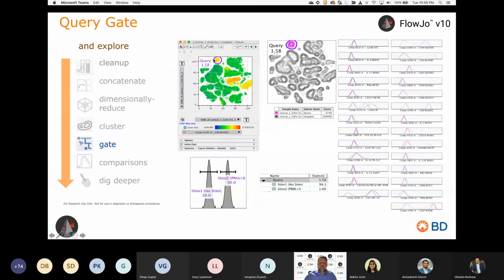They've upregulated the cytokines in the panel, and therefore they've moved to a different region. And I know they're still going to be CD8, so it must mean that they're down here somewhere in the stimulated condition. But that gating apart of your samples in conjunction with a query gate can allow you to just mine this data space by moving the query gate around and finding any phenotype of interest based on focusing on one marker and then getting the combinatorial phenotype.